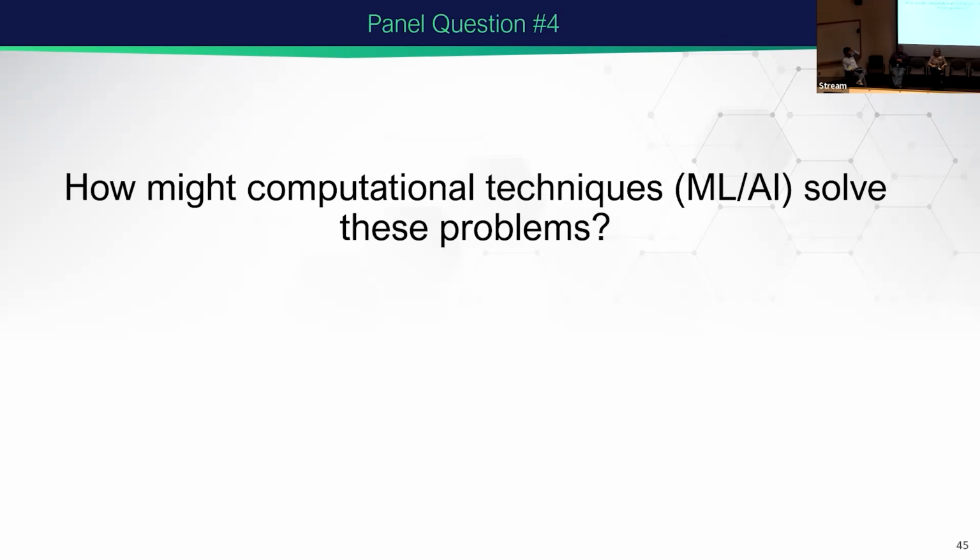Yeah, I guess I'm going to pass on this question because I've done a lot of TOF-SIMS in the past. And of course, everything that Kristen just said is applicable there, and segmentation is a more difficult problem than you think it would be, but it's not really applicable to everything I do right now.